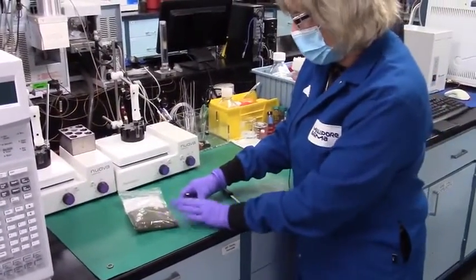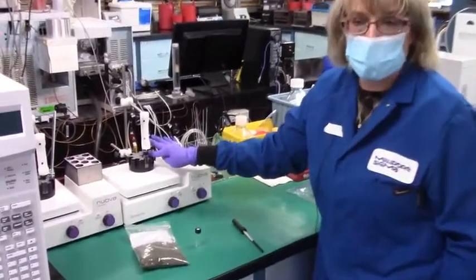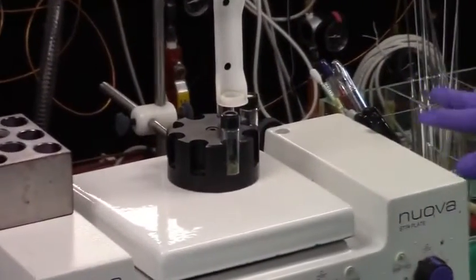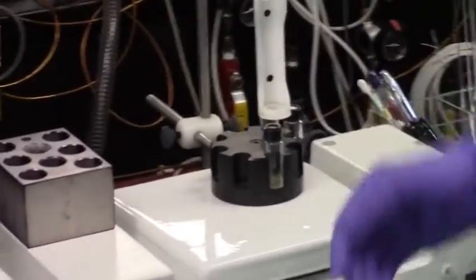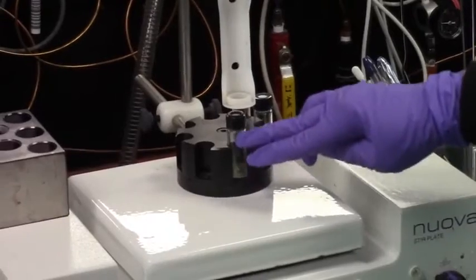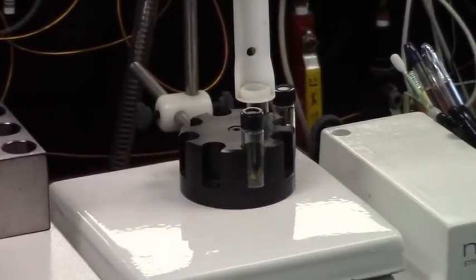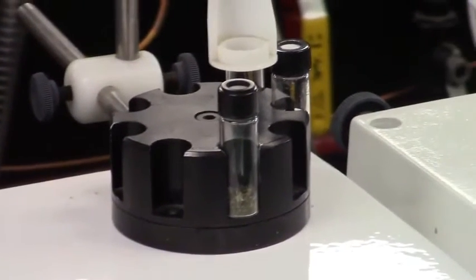And then the next step after weighing my hemp into the vial was I put it on this heated block, and I have this block at 40 degrees centigrade, and I let it sit for 10 minutes. I'm giving the terpenes time to volatilize out of the leaves and flower material, and to enter into this empty space, which we call the headspace over the sample. So now I'm going to actually expose the fiber to that headspace, and the terpenes are going to be extracted by the coating on the fiber, by the carboxen coating.